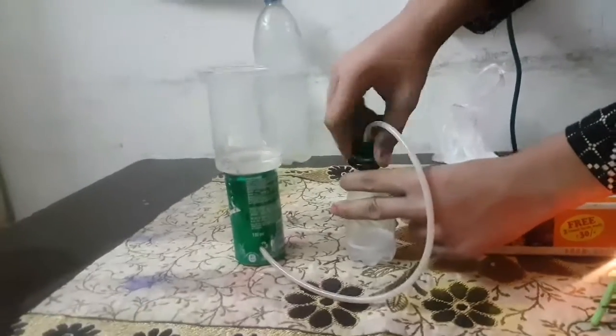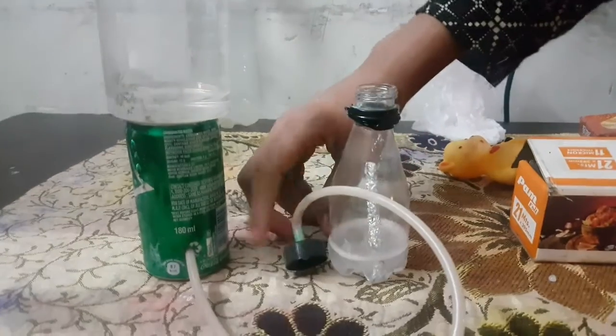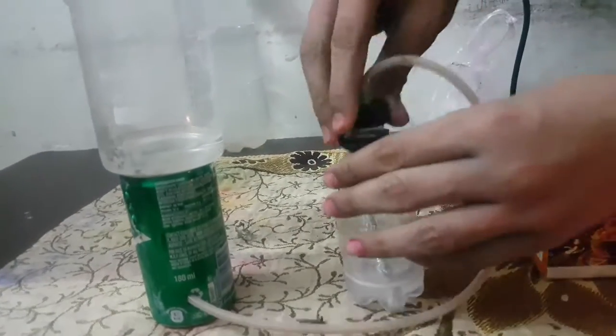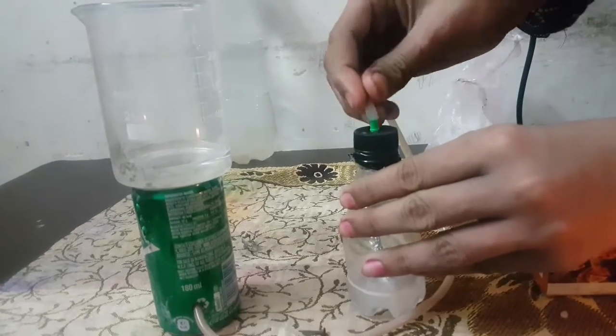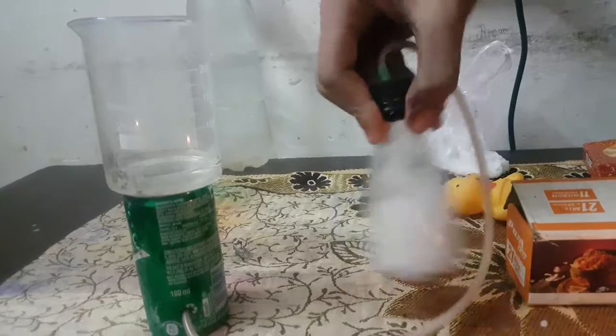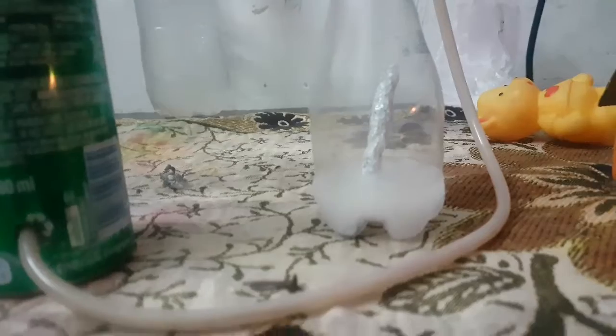The only thing we need is caustic soda and aluminum foil. The reaction will start. We have to stir it a little bit. As you can see, the bubbles are coming out.